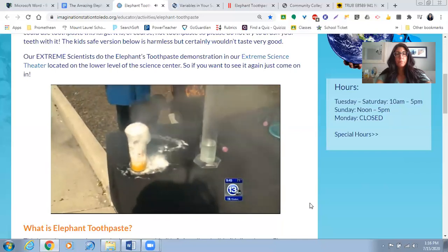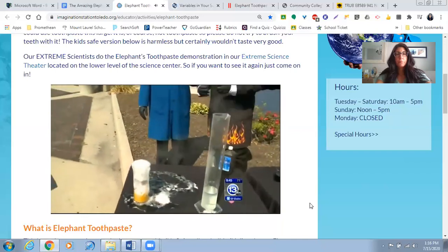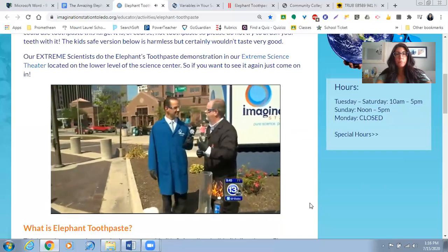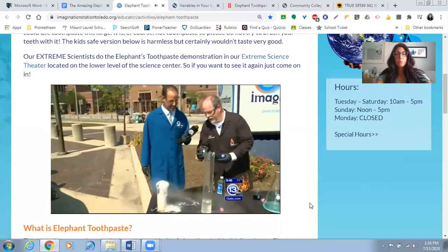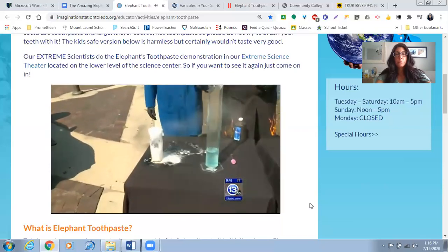This is an exothermic reaction. All right, so we're generating heat. We generated lots of oxygen gas there. But for me, it was a little disappointing because I really want to capture those bubbles in some soap. Of course you do. And then we can make a foam. Okay? So same deal here. We've got some hydrogen peroxide, 35%, some Dawn dish soap. We'll just add the dish soap into there. And I'm going to give you the honor this time, Tony.